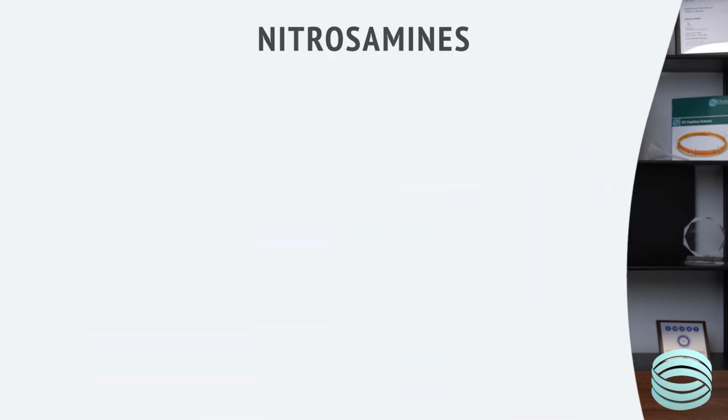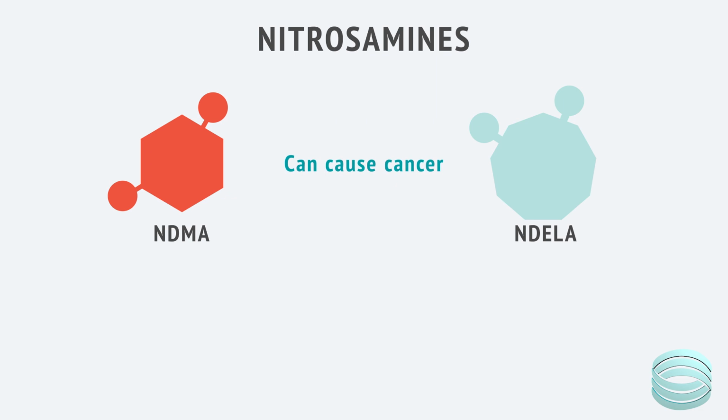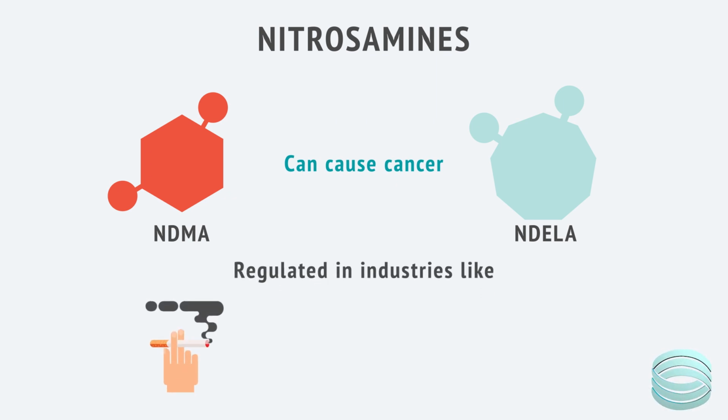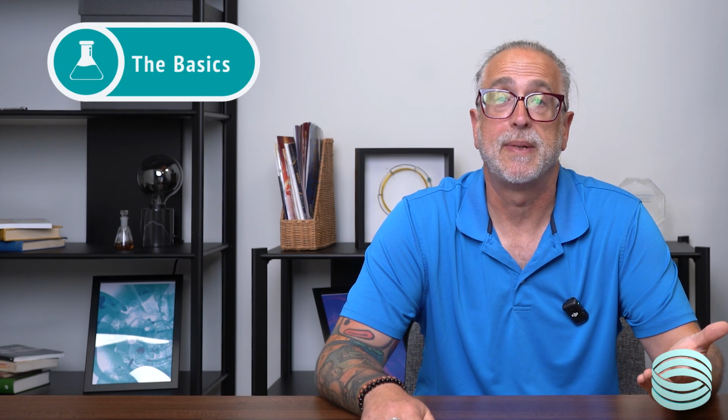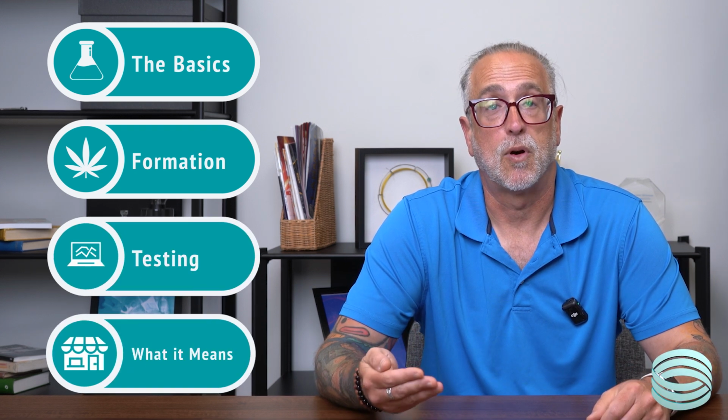Some of these compounds, like NDMA and NDELA, are known to cause cancer, and they're tightly restricted in products like tobacco, pharmaceuticals, and cosmetics. But in cannabis, they're barely on the radar. That gap matters because under the right conditions, nitrosamines can form in cannabis too. In this video, we're going to talk about what nitrosamines are, why they might show up in cannabis, how they're tested, and what that means for you as a grower or seller.